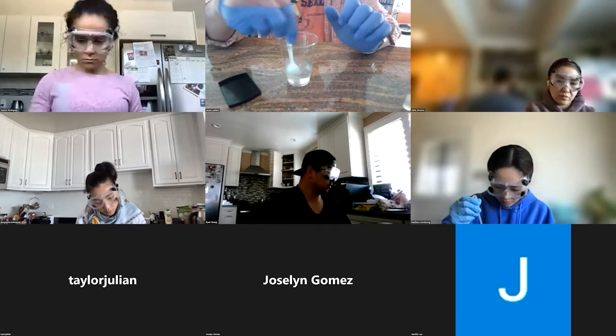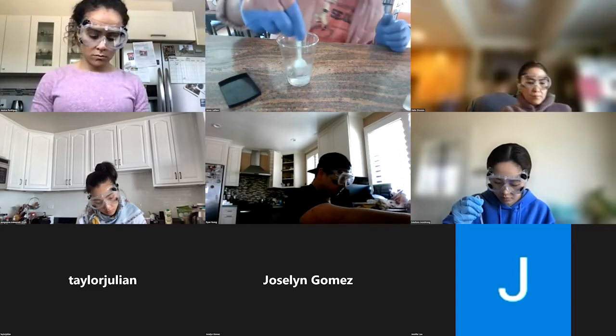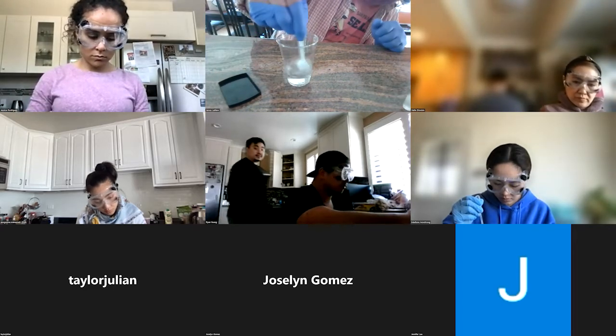Yes, you want to mix it up. You don't want to shake it too hard so that you get nothing but bubbles. I mean, you do want the soap to go into solution.